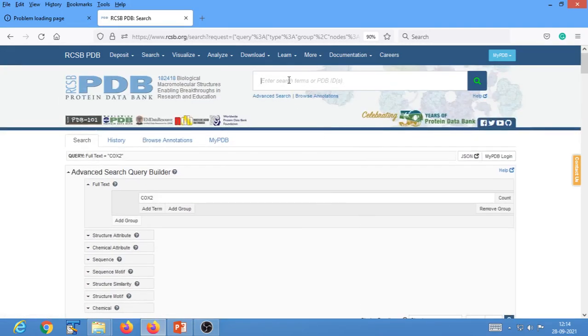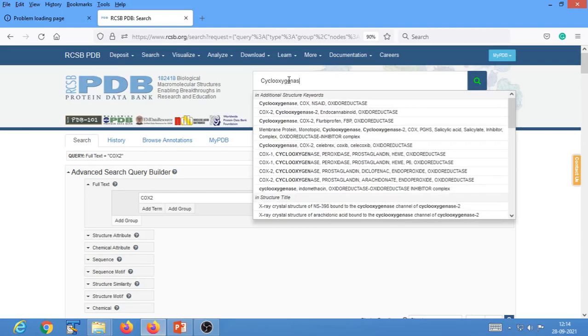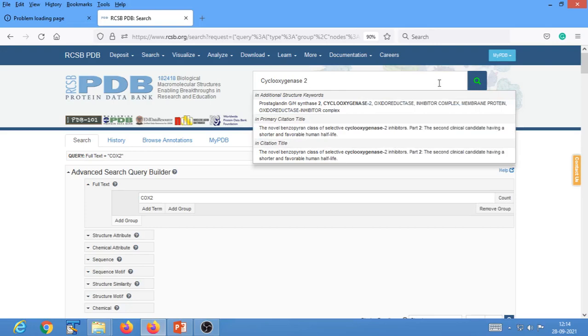I would just simply search for cyclooxygenase 2.